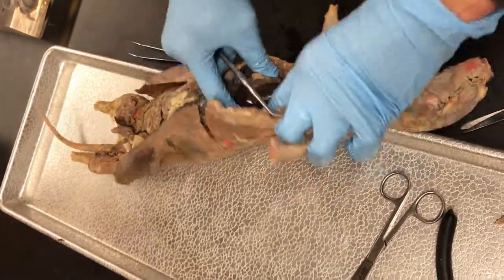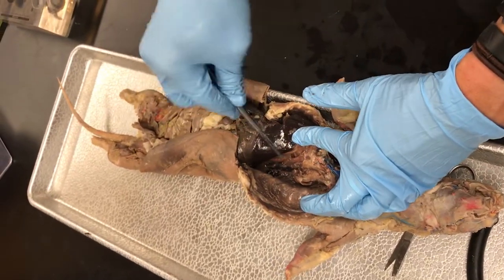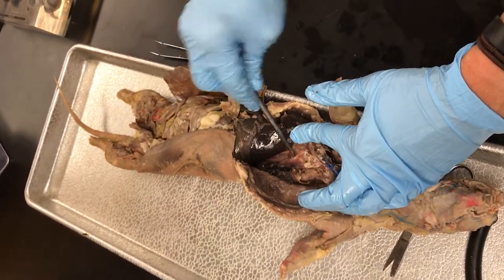For the aorta, you do the same thing, but now you go over to the right and scrape away at that tissue to find the aorta right there.